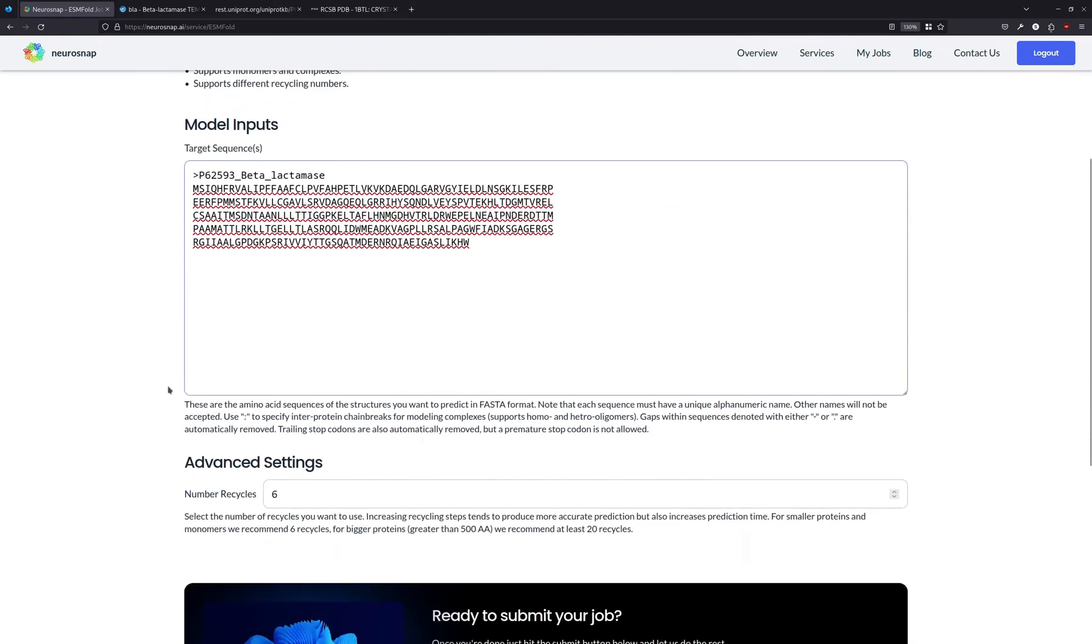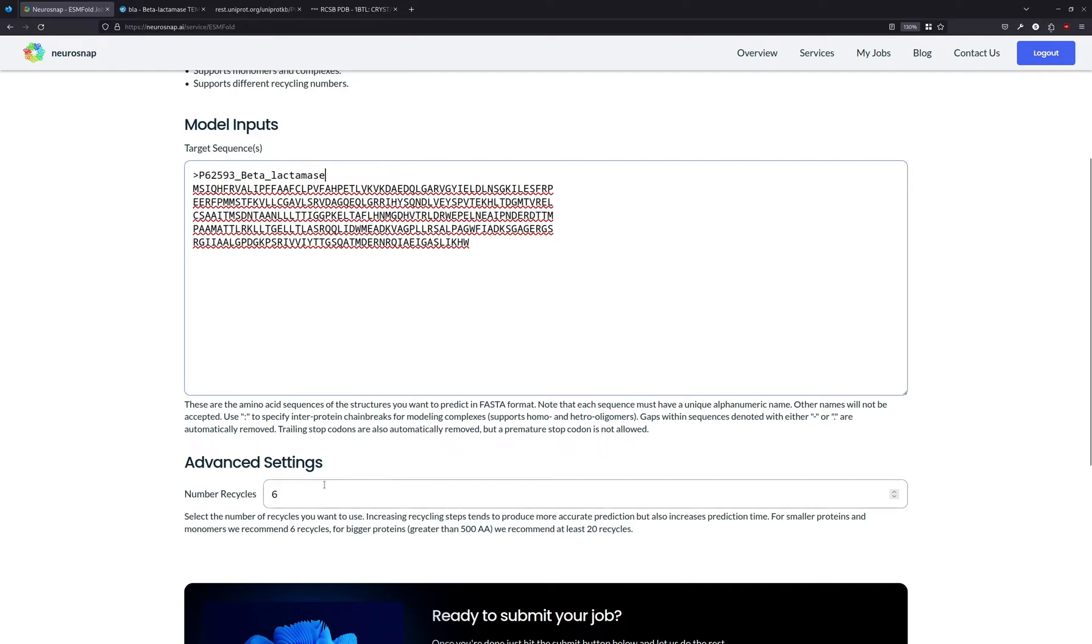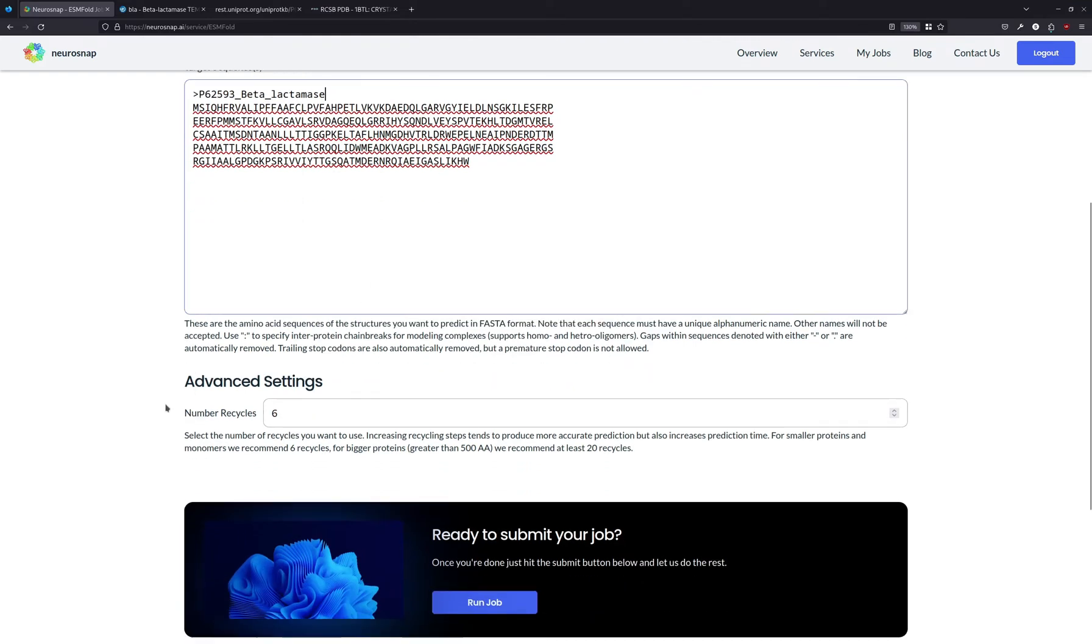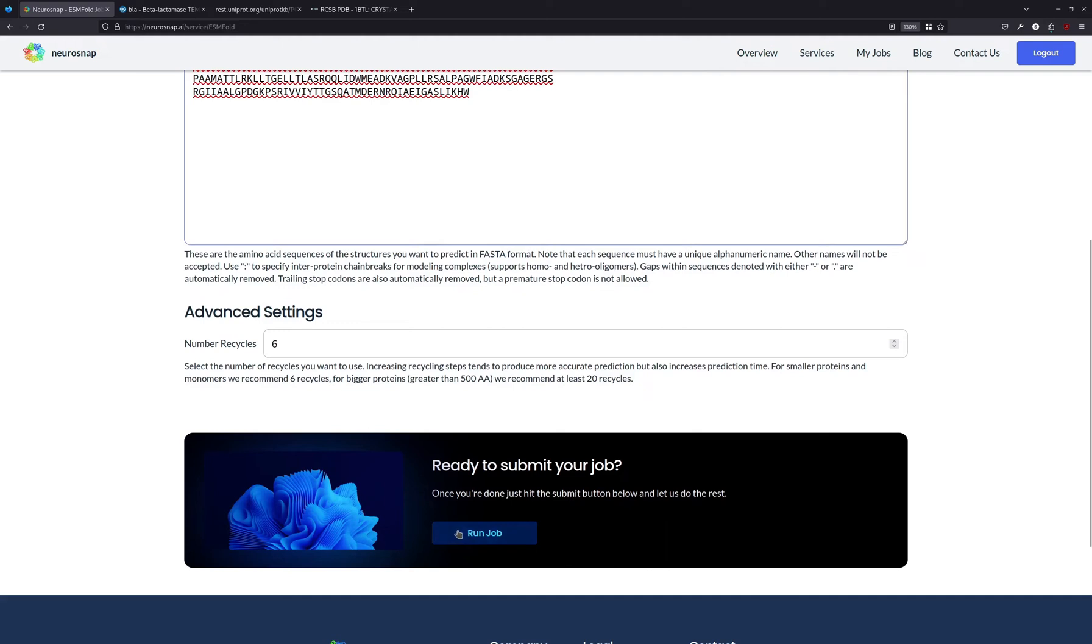Then we're going to set the recycling steps. This number of recycles is a way for the model to build off of its prediction. The higher this number, generally the better and more accurate the output prediction is going to be. But in this case, because beta-lactamase is a fairly small protein, six recycling steps should be fine.